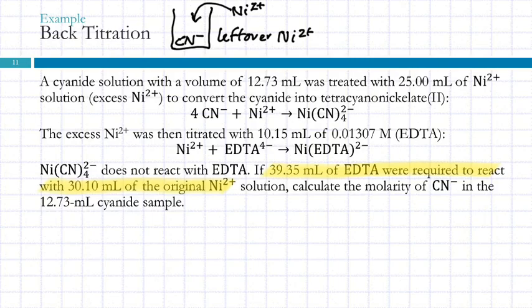39.35 milliliters of the EDTA. And do we know the concentration of that EDTA? Yeah, it's given up here. 0.01307 molar.